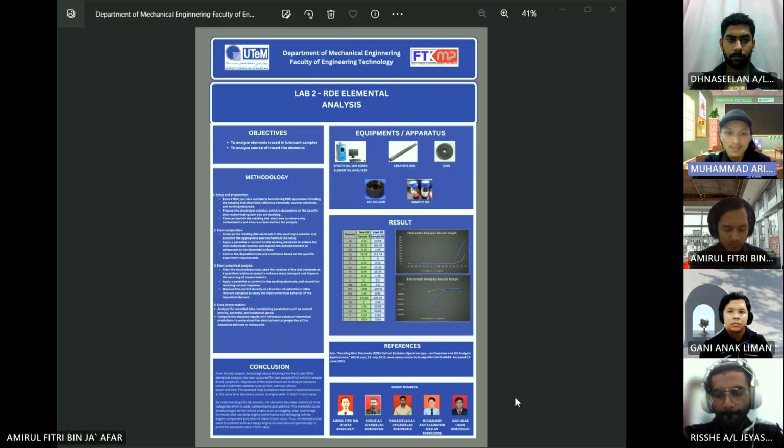components. Boron is present in both the new oil and used oil samples, with the used oil sample B1 demonstrating a substantially higher concentration of 162.46 ppm compared to the new sample B with 30.29 ppm. This notable increase in boron content in the used oil might indicate the depletion of boron containing additives or the ingress of external contaminants during usage.